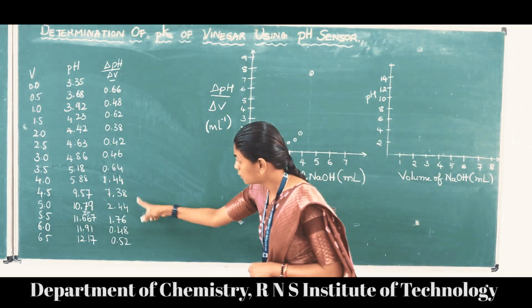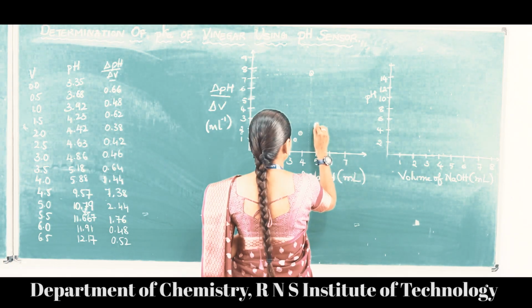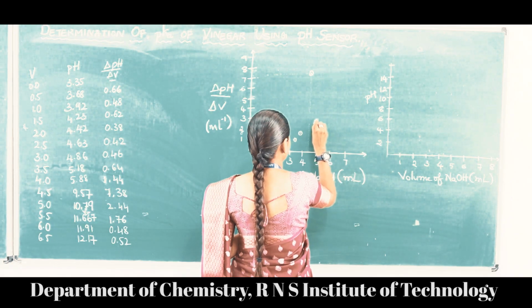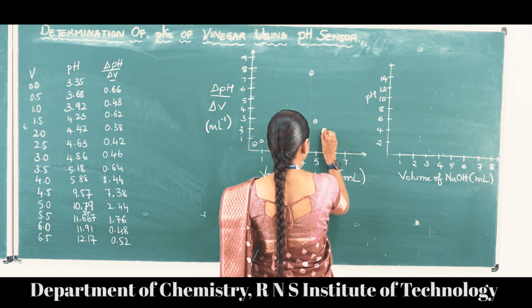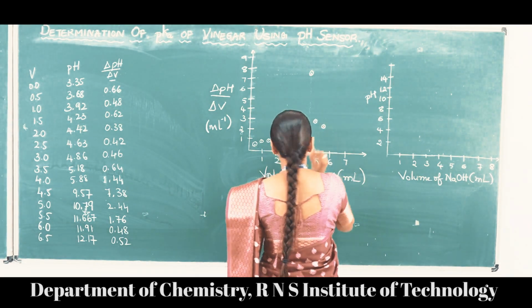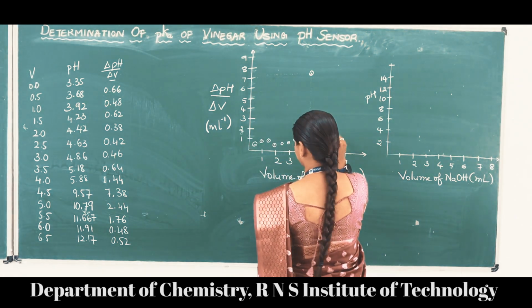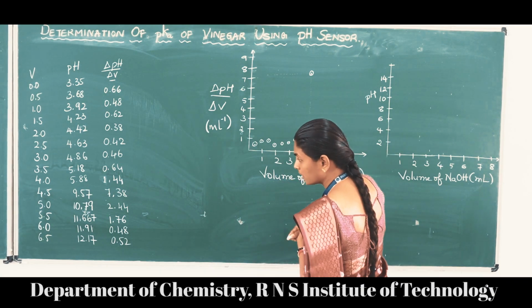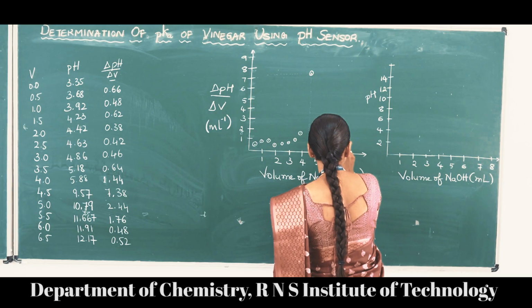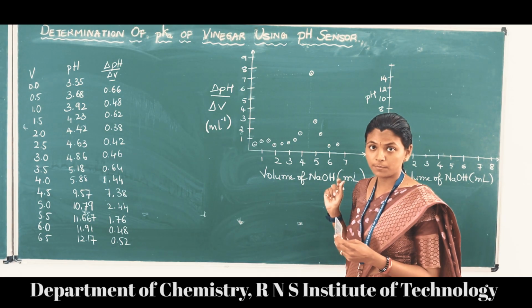And then we have 2.44, which is somewhere around here, 1.76, 0.48, and 0.52.